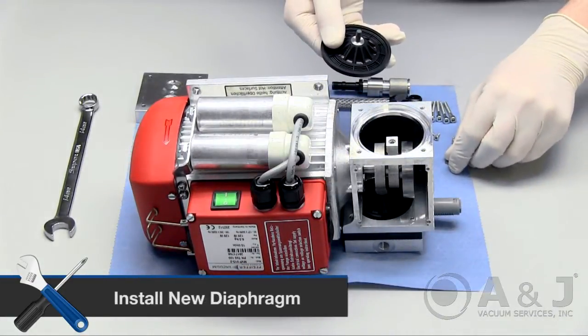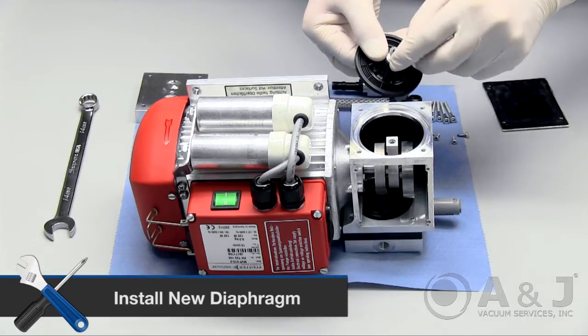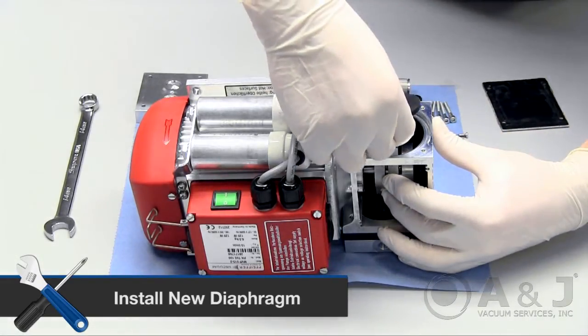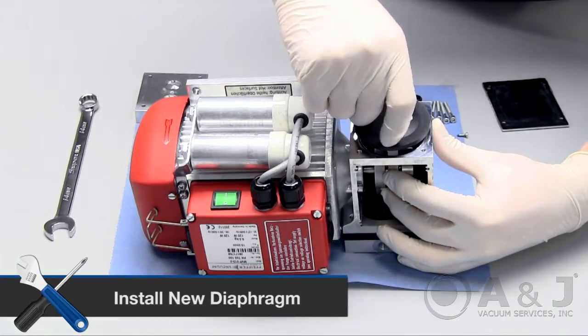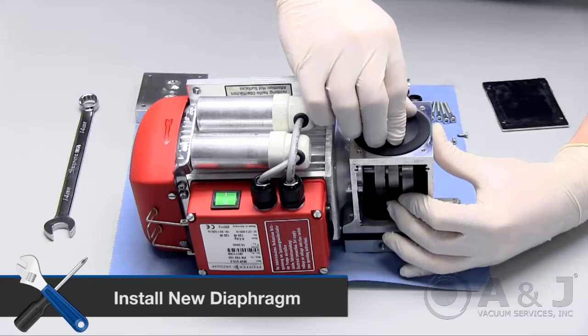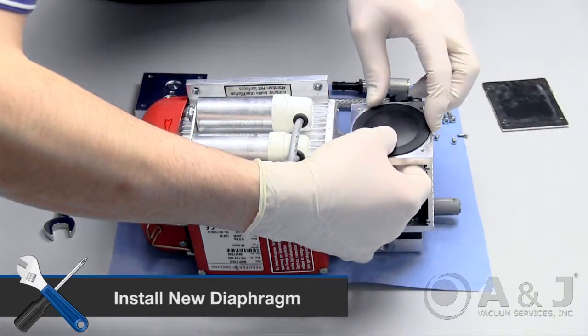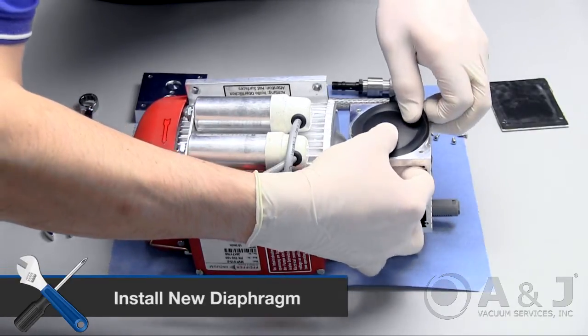Place the previously removed shim back on the new diaphragm threading. Hold the shaft straight up with one hand and with the other hand, gently place the new diaphragm and shim down and screw back into place. Push down on the rim of the diaphragm and make sure it's sealed tightly into the shaft housing.